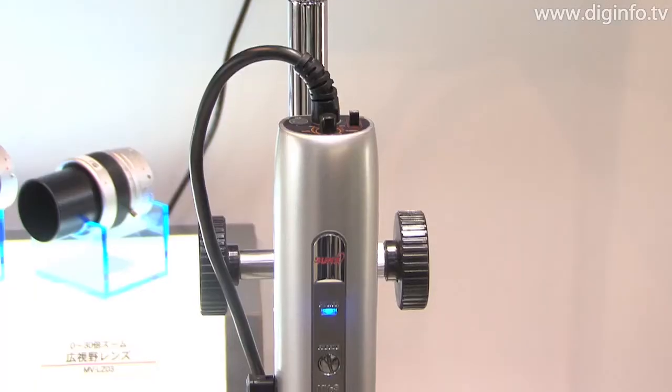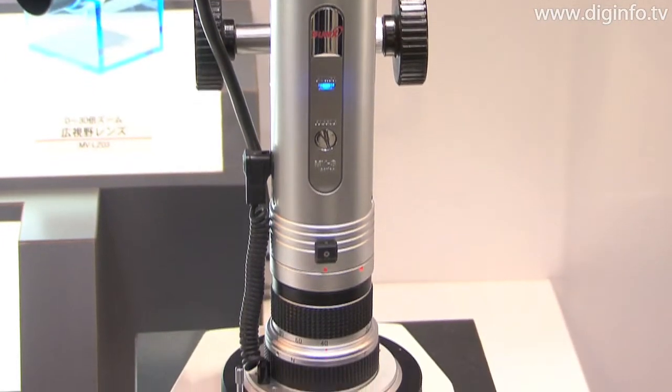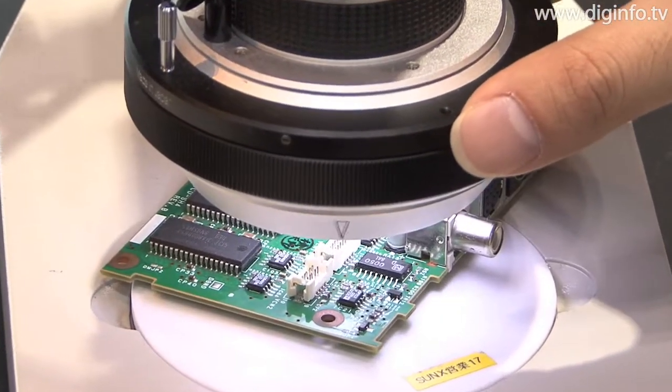The unique feature of this fine microscope is that the sample can be rotated 360 degrees even when the stage is secured, and as a result, the sample can be easily observed with a 3D panoramic view.